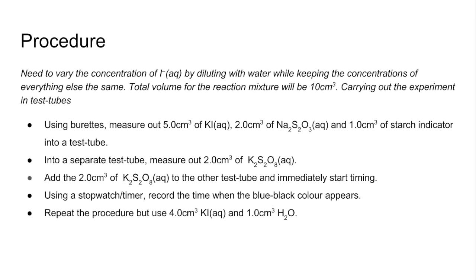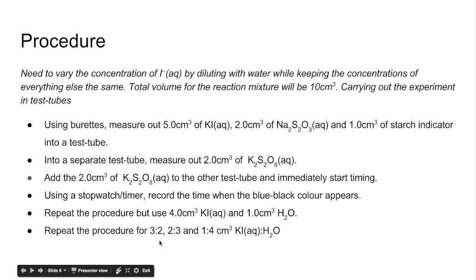We're then going to repeat that procedure, but instead of using 5 cm³ of just KI, we're going to use 4 and 1 water. Total volume is still 5, but we're starting to dilute it down a little with water. Everything else is the same and we'll time how long that takes to go blue-black.